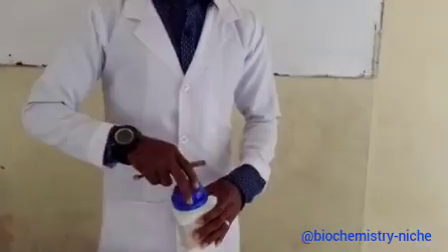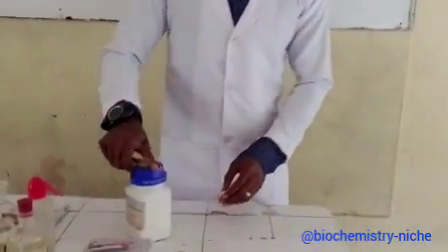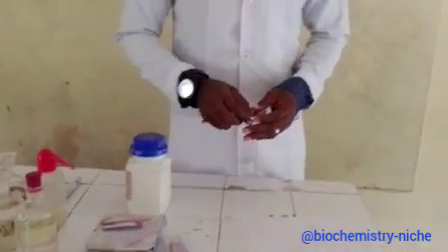So please, I will encourage all of us to try as much as possible to pay attention to what we want to do today. Now, NECO has asked us to make available a particular type of salt, and that is what we will be using today. So we'll quickly use this salt to think about possible questions that you can come across in your exam. Now, it is very important for you to know that there is a way in which you can carry out this experiment and get the best grade out of the exam.